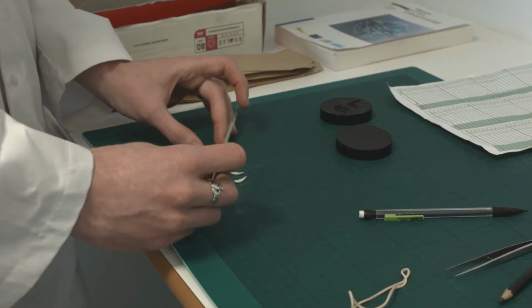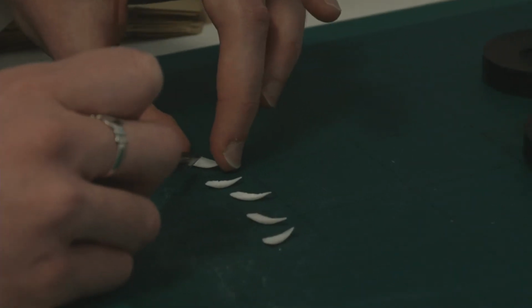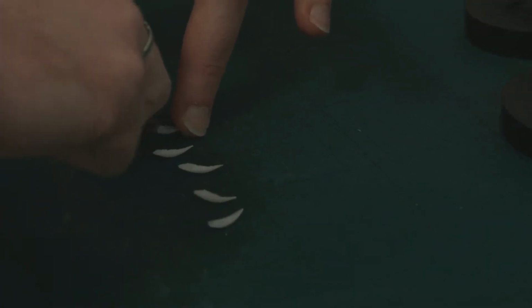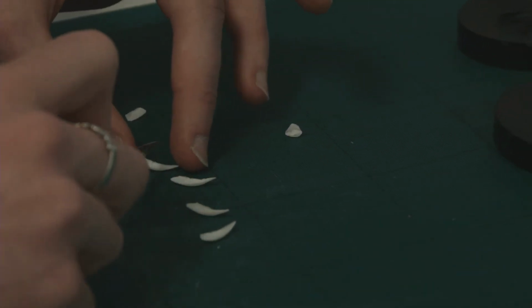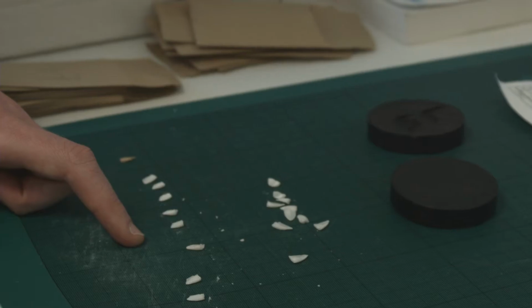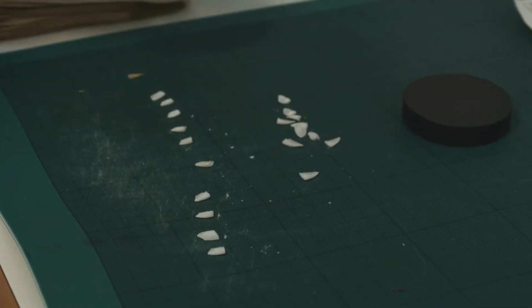We just need one otolith to read them. We can use the other one to check. Now we section them across the nucleus, which is essentially the center where the otolith starts growing. We just need 1/2 of it. We've now got 2 sets of 5 here, so we'll just put them in the mount.